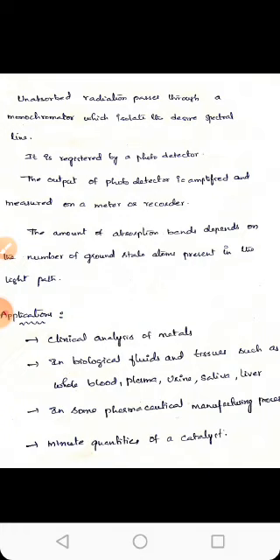Here we are using a flame or graphite atomizer in order to excite the ground state atoms. When the ground state atoms are excited, they absorb some of the light radiation. The unabsorbed light radiation passes through the monochromator and forms the desired spectral line. This spectral line gives the signal, which is recorded in the recorder. So this is the instrumentation of atomic absorption spectroscopy.